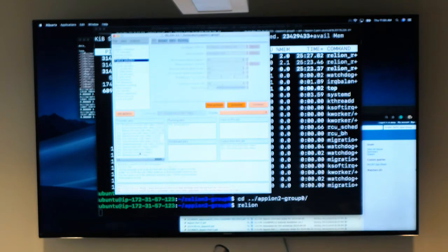I was very explicit here. RELION will tell you the rescaled pixel size, which in this case is 1.7-ish. There's a little shy of 60,000 particles from 443 micrographs. Note that there are closer to 500 in the folder, but not all the micrographs had box files to use.